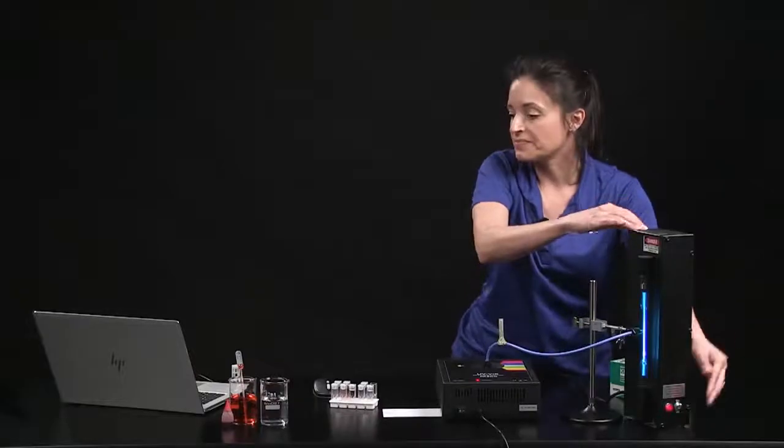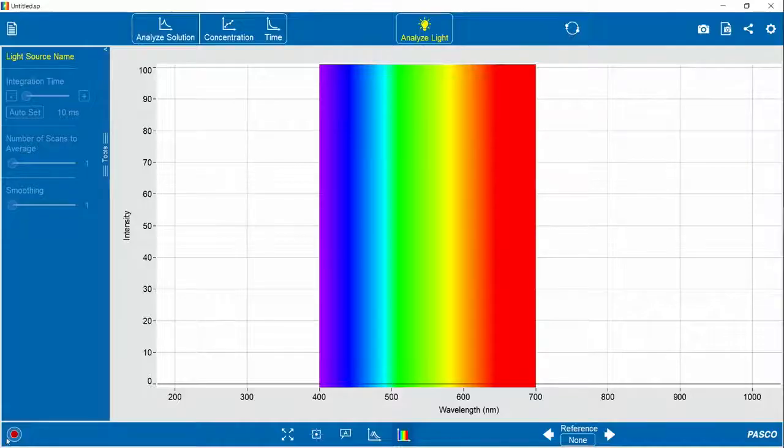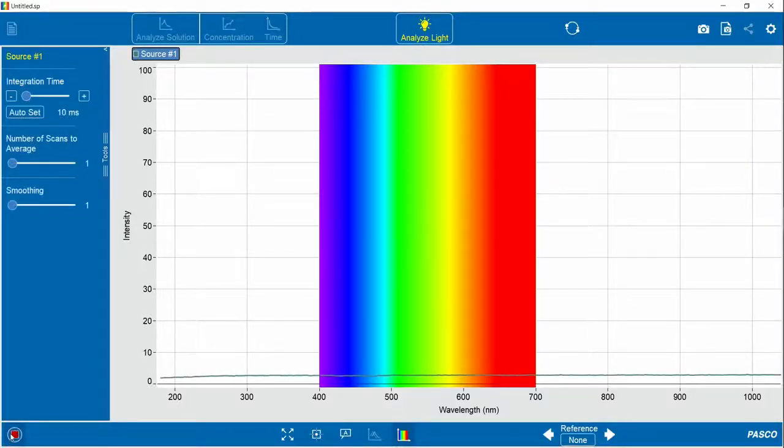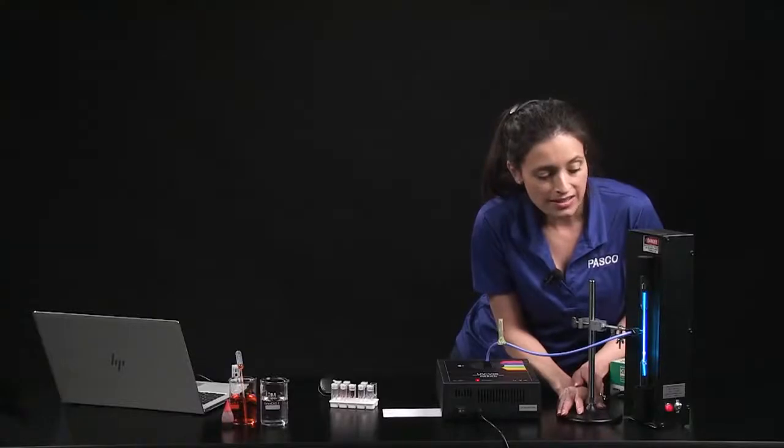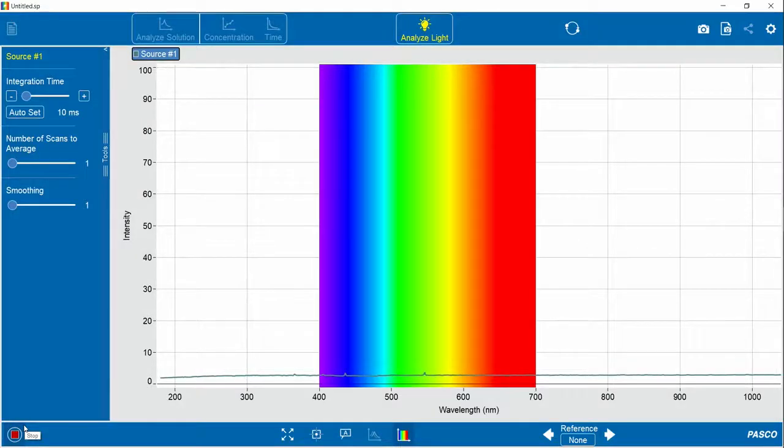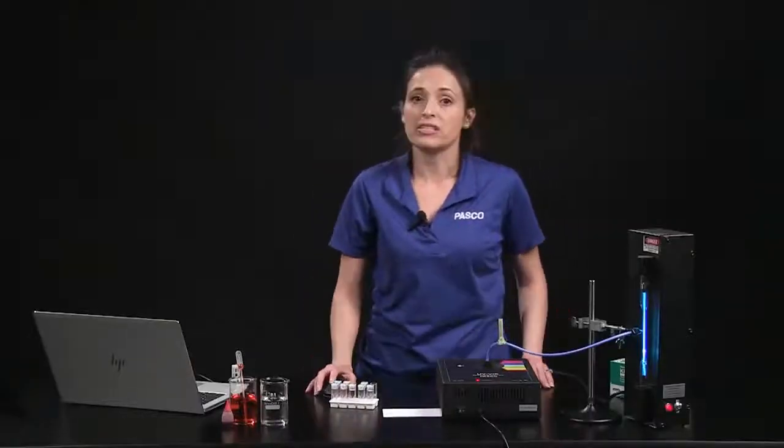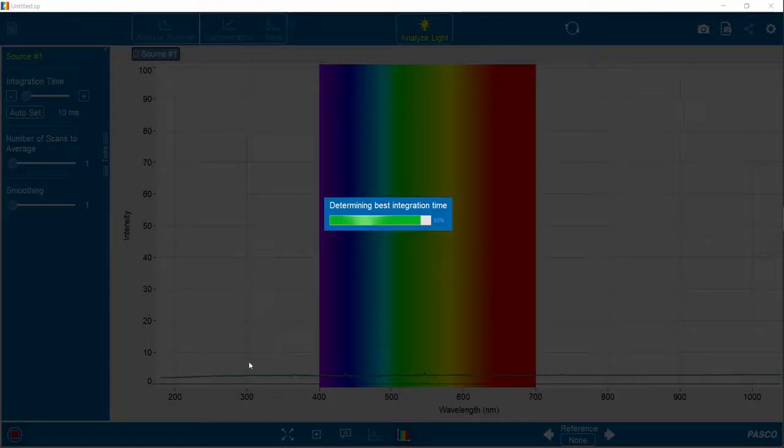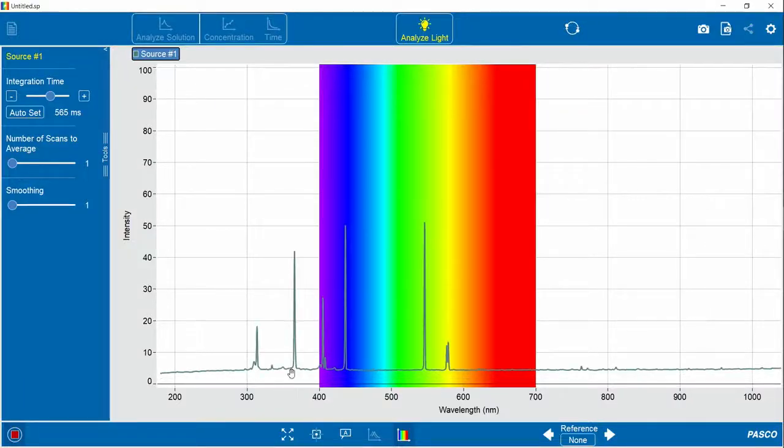Turn on your light source, start collecting data. Let me adjust the distance and position. And I can improve the signal if I auto-set the integration time to eliminate background noise. The software does this automatically.